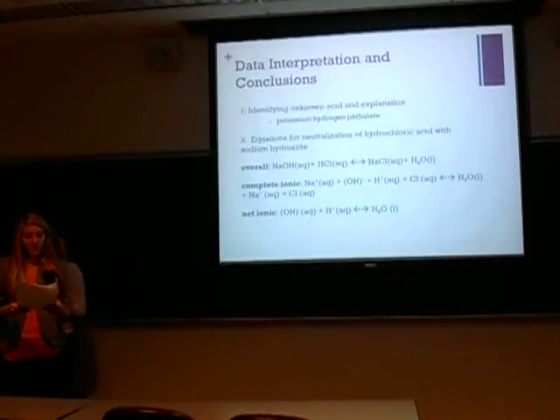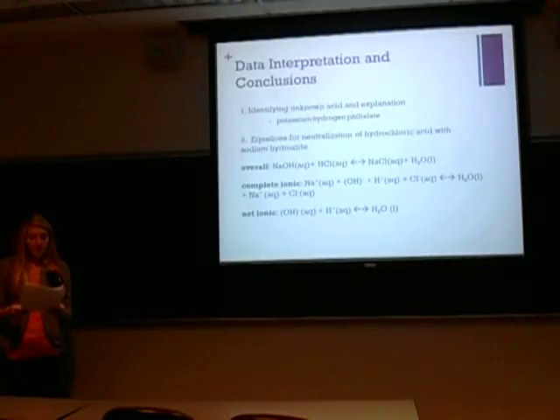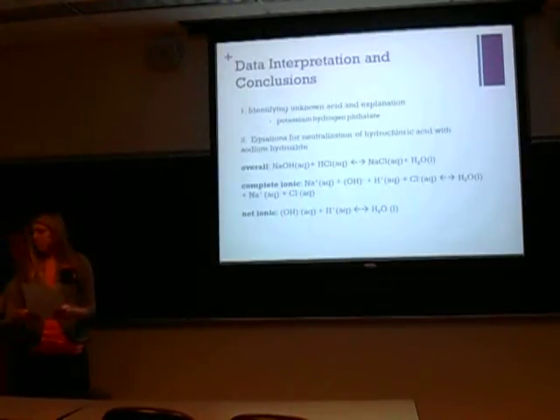They're not exactly the same because some human errors could have occurred and been calculated into the values. For the unknown weak acid and strong base, the error percentage was about 10.85%. In this example, the error percentage was 5.71%.